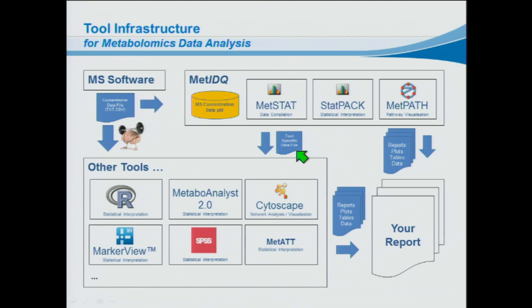So you have now seen the complete workflow to the pathway analysis, but what I want to tell you is, that's not the only way to analyze data. There exist a lot of fantastic tools out there, and a lot of fantastic methods to analyze the data. What we want to do is offer as many tool-specific export formats as possible.